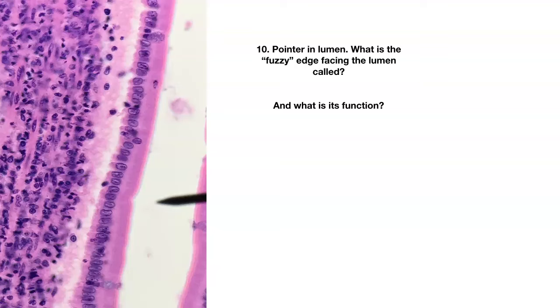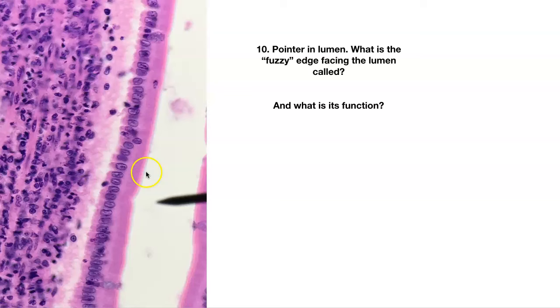Number ten — here's a close-up of our simple columnar cells. Here's the lumen. The apical modification is a fuzzy border — this is microvilli. Some places call it a brush border because it kind of looks like a brush. Unlike cilia, which you can really see, microvilli are just a blurry edge. What's its function? Microvilli increase the surface area of the cells for absorption.